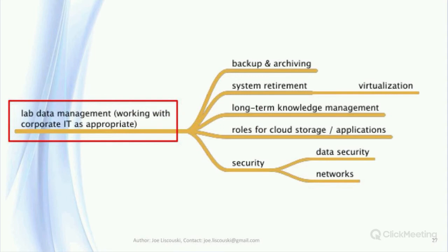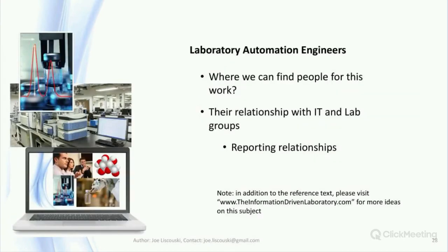We looked at these issues in previous sessions. The LAE's role is to cover a lot of the responsibilities that were directed to corporate IT support. The lab automation engineer's knowledge of lab operations would help ensure that the lab's critical requirements are given the consideration that's needed.